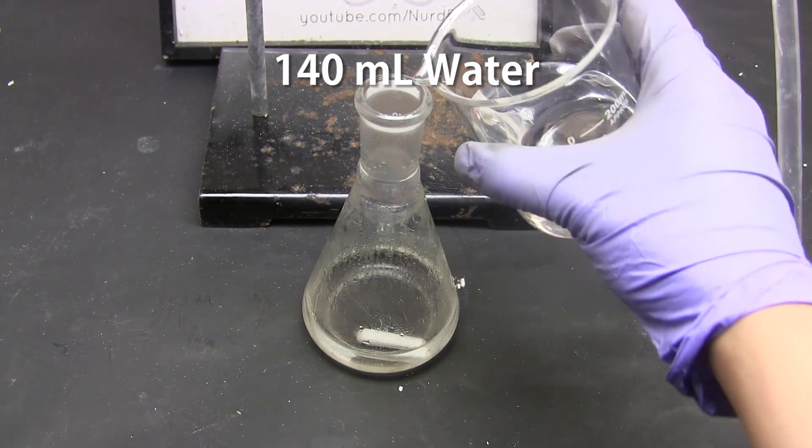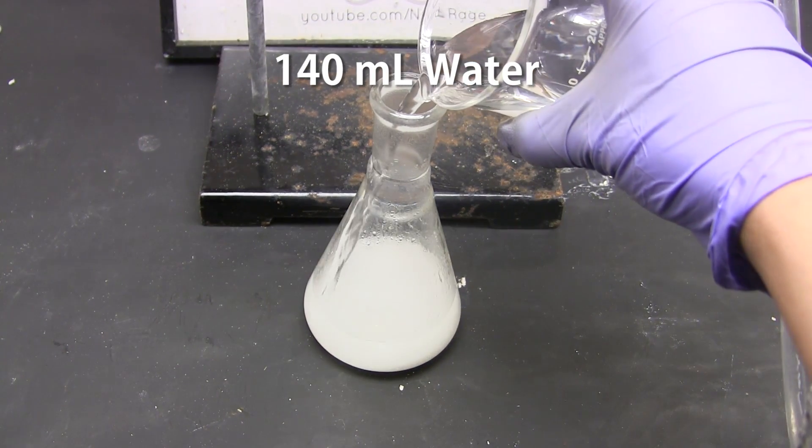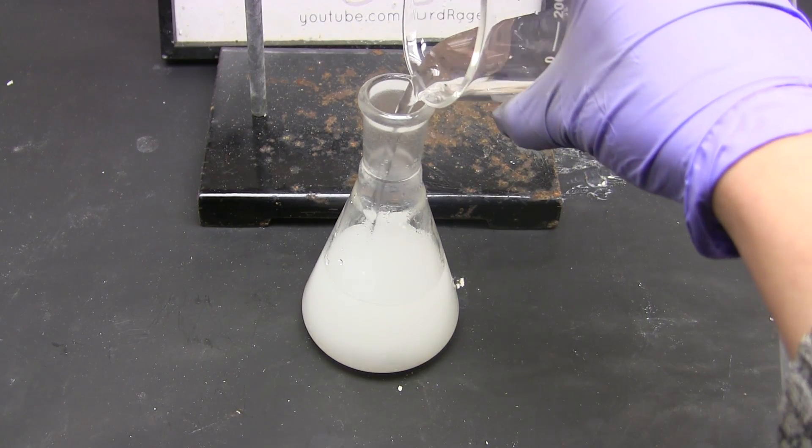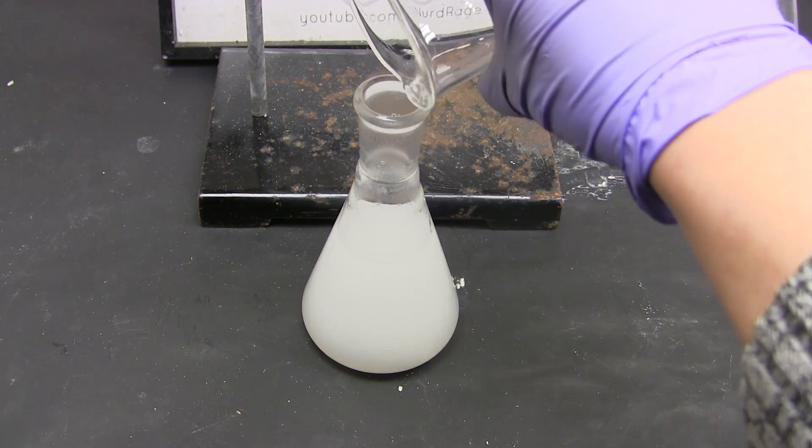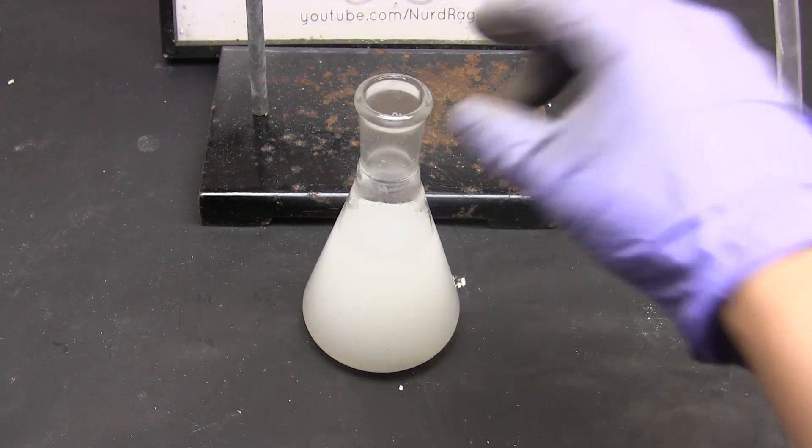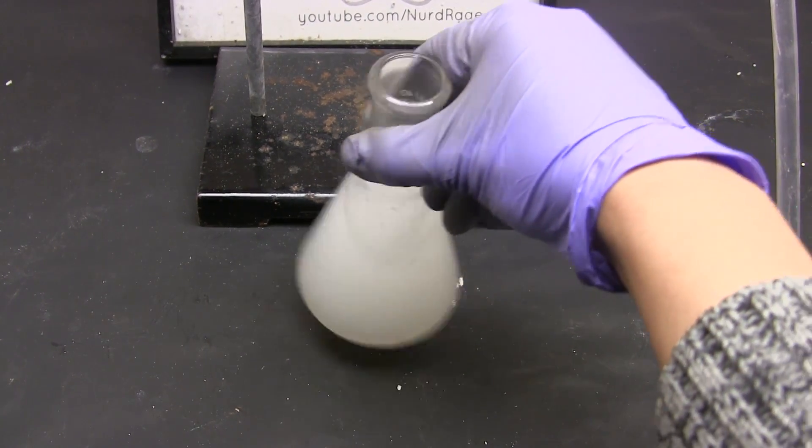Now we add 140 mL of cold water. The propionic acid, sulfuric acid and ethanol are all very soluble in water. But the ethylpropionate has very low solubility and conveniently has a lower density than water.